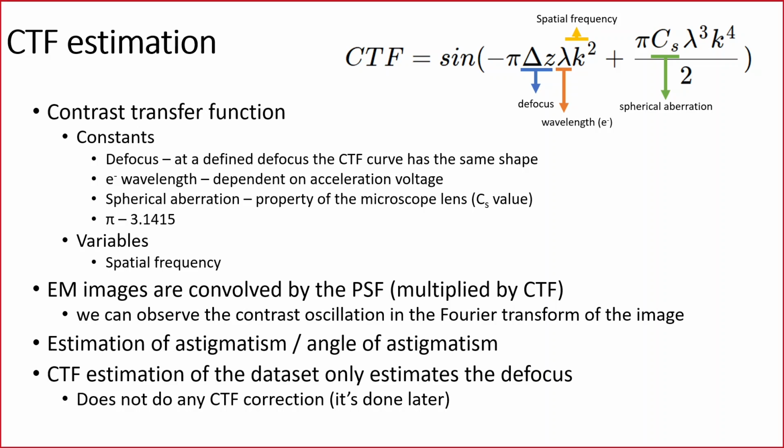But the problem is that when we are setting up the microscope and telling it to set a defocus of minus 1.2 microns, the microscope will set a defocus of something very close to 1.2 microns. Yet this precision is not enough for high resolution CTF corrected refinements. Therefore, we need to mathematically approximate what the contrast transfer function of the image is. And this is quite easy.